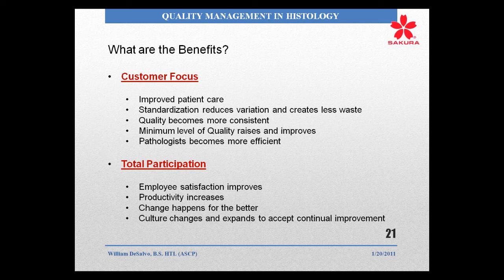And when we talk about total participation, you'll be amazed how the involvement raises employee satisfaction. Think of it, how many times in your laboratory has somebody said, gee, I wish the supervisor would change that, or I wish they would do something about that. Well, when you move to a quality management system, the they is them. They have the power to help move that, and they see that they have that power, and that really gives them a high level of satisfaction.